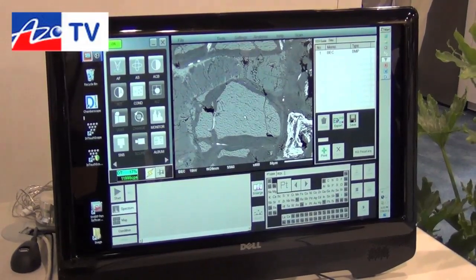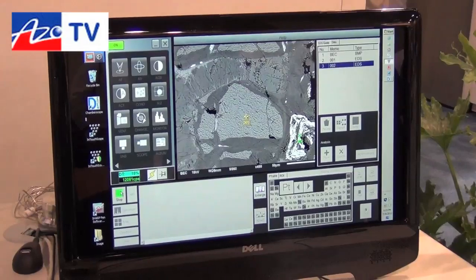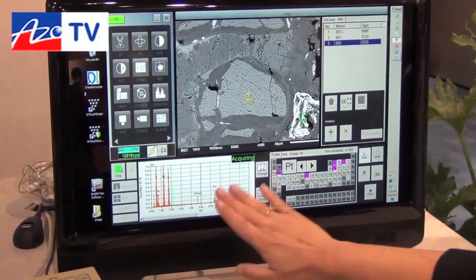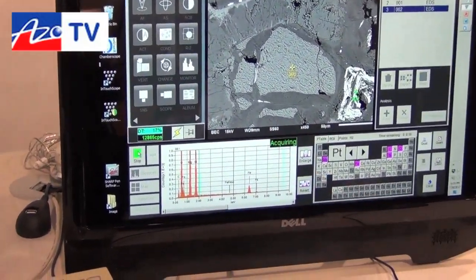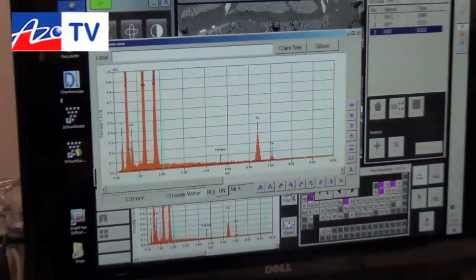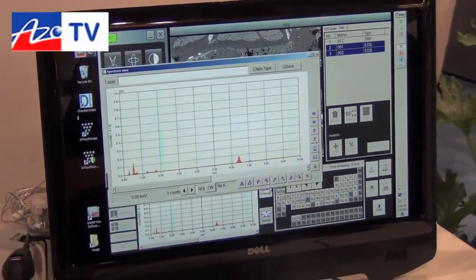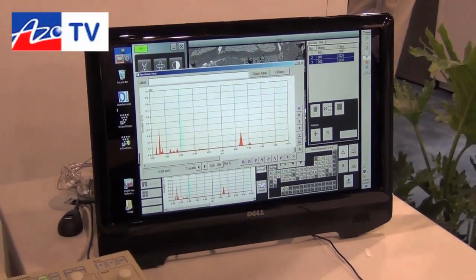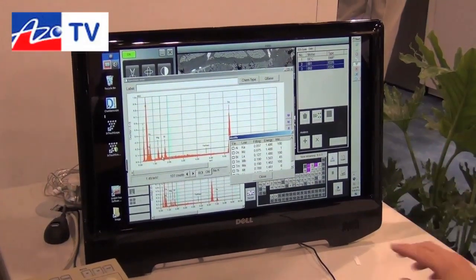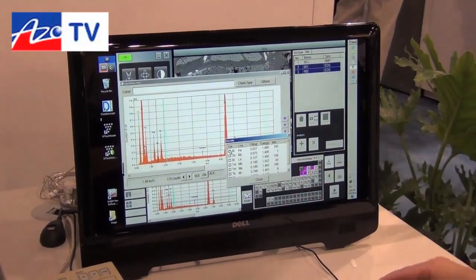I'll just take a couple of points. If I want to know the composition of the gray area versus the white area, I'll select the points and hit start. It starts collecting the spectrum sequentially, automatically identifies the peaks for me, and I can enlarge that so I can query the data as I go. If it misses a peak until the counting statistics get right, I can just double-click and it will give me the candidate elements — what might be possible for that area.